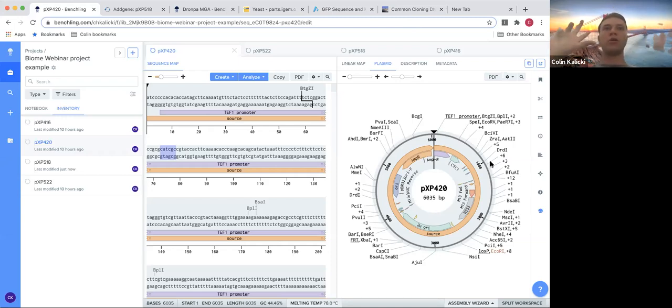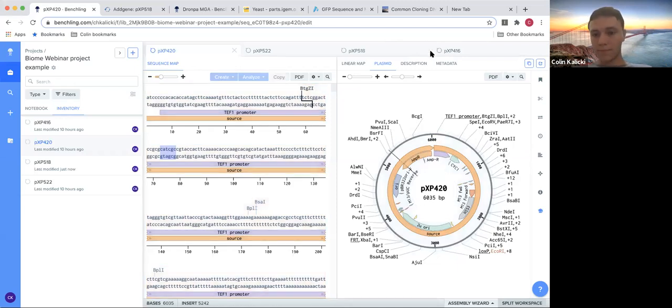Think about how you're going to do this experiment outside of the computer. How would you actually insert a gene into a plasmid? Why do you need a restriction site in order to insert a gene into a plasmid? Yeah, exactly. There are locations that are being cut by restriction enzymes. Great minds think alike. So now that you've opened up, you cut this plasmid, and exactly, you've got new DNA that can be added. Good. Awesome job. Yeah, perfect. So either you isolate too, yeah, if you want just one specific gene. Good. So I'm going to close my chat. If I get questions, I apologize.